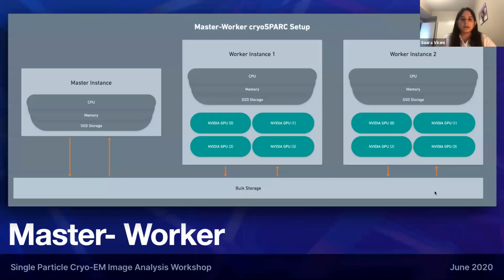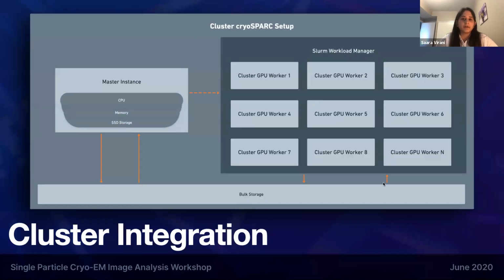Awesome, thank you. And finally, we talked a little bit about the cluster setup for physical clusters. Can you talk a little bit about running CryoSPARC on AWS? Yeah, actually, we have a lot of instances where AWS has been used, specifically ParallelCluster. So ParallelCluster is essentially a managed cluster system that will allow you to select one of their AWS nodes to use as a worker, and you select a master node, and it works the exact same way.